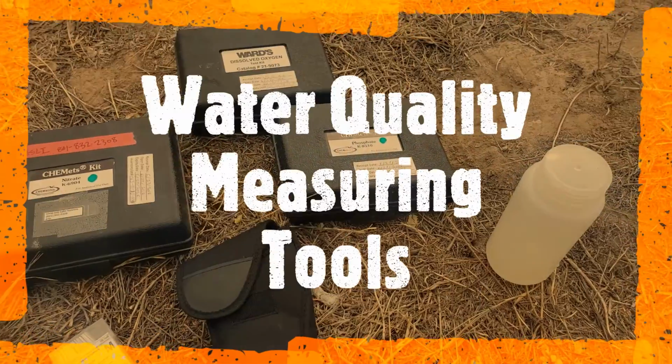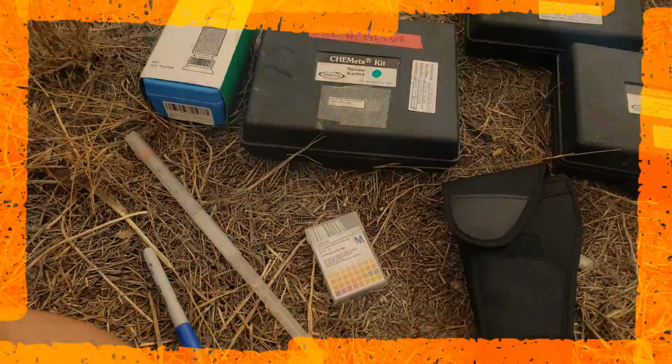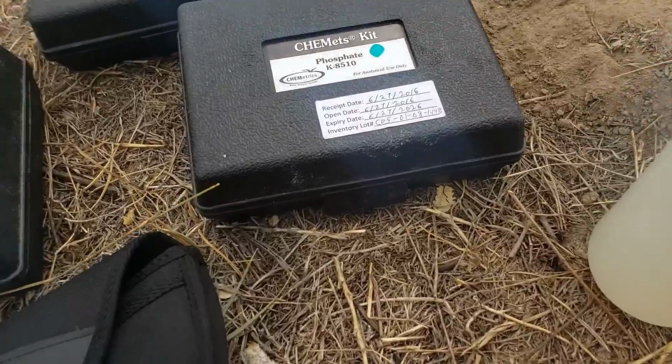Okay, so I took my sample. Here it is, yum, yum, yum. And let's go compare it to the river. So we're comparing a wetland pond to a river. Here we go. So here's the very efficient lab bench that we have, and we have all of our tools laid out here. So let's walk through them.